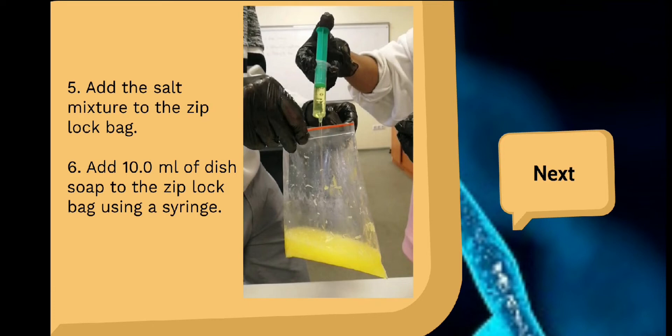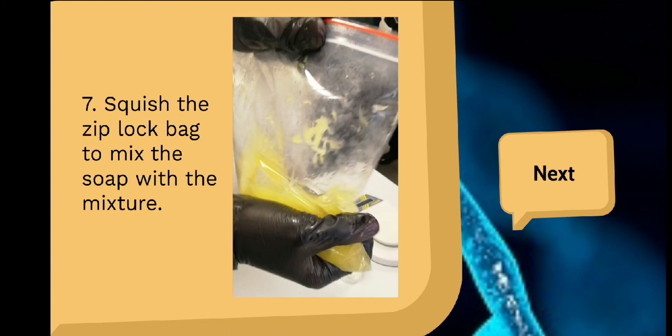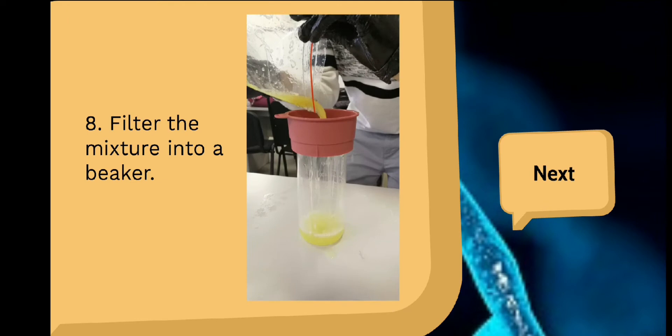Add the salt mixture to the ziplock bag. Add 10 ml of dish soap to the ziplock bag using a syringe. Squeeze the ziplock bag to mix the soap with the mixture. Then filter the mixture into a beaker.